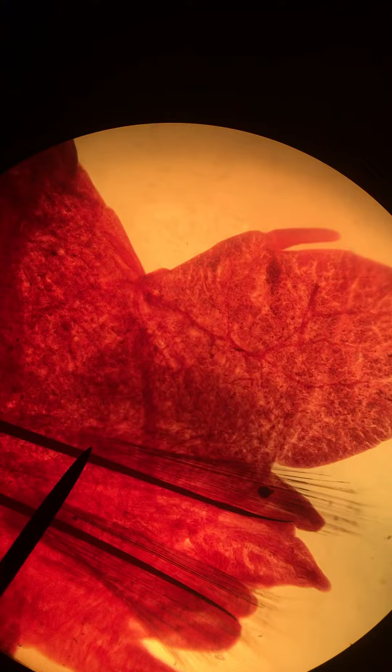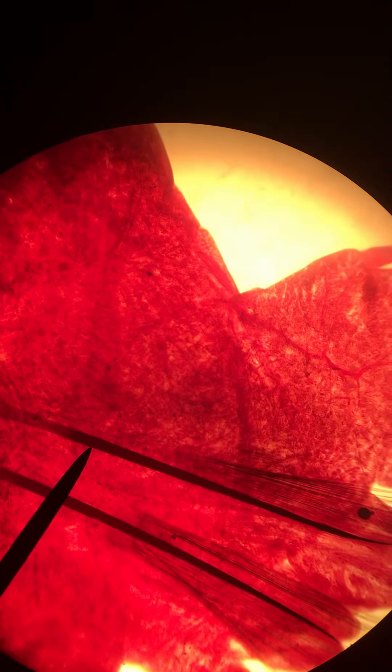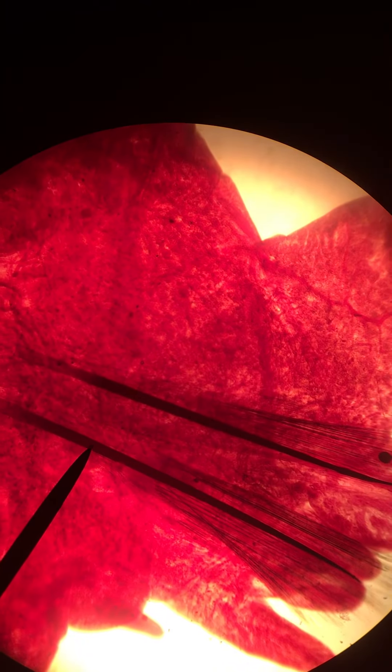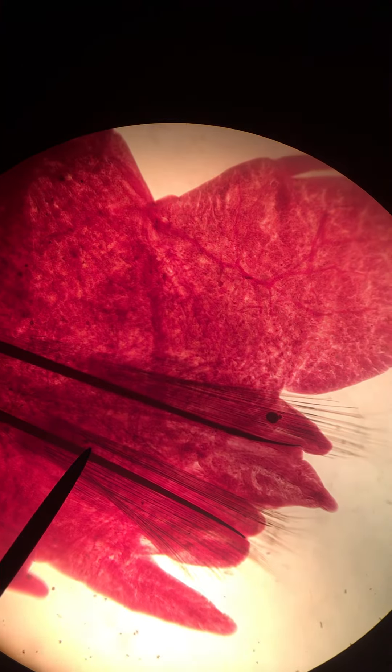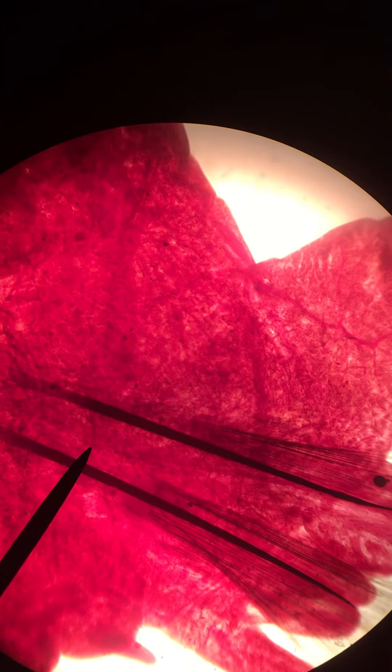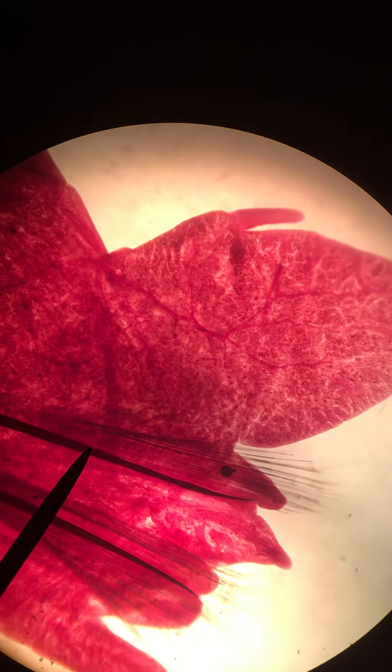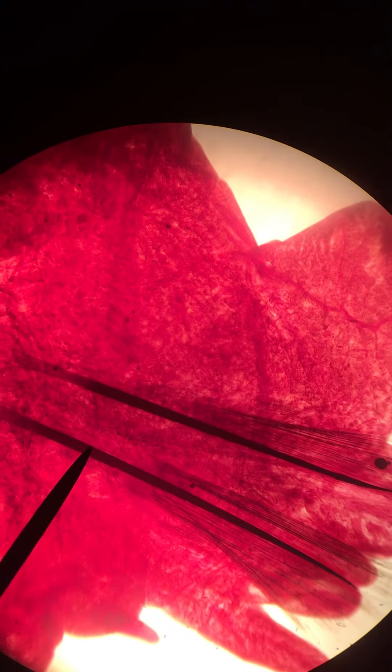The two dark structures here, this and this, are the aciculi. These are chitinous rods that are support structures in the parapodium.